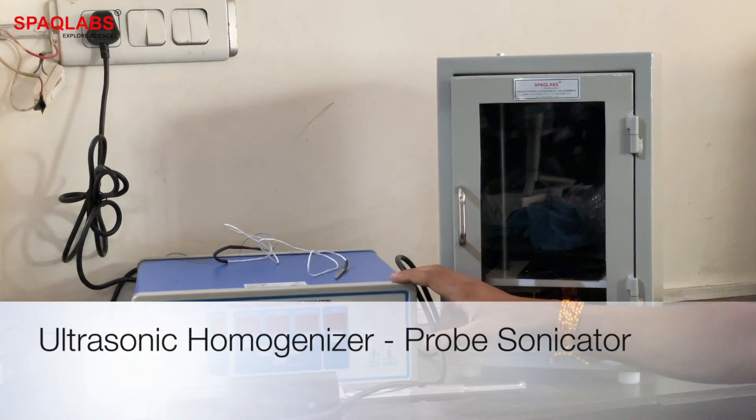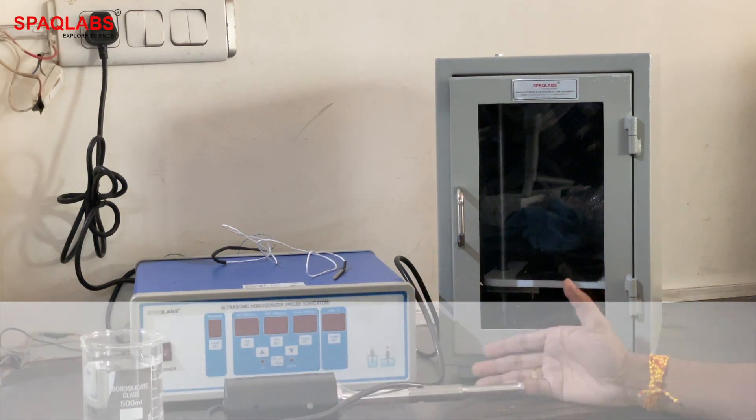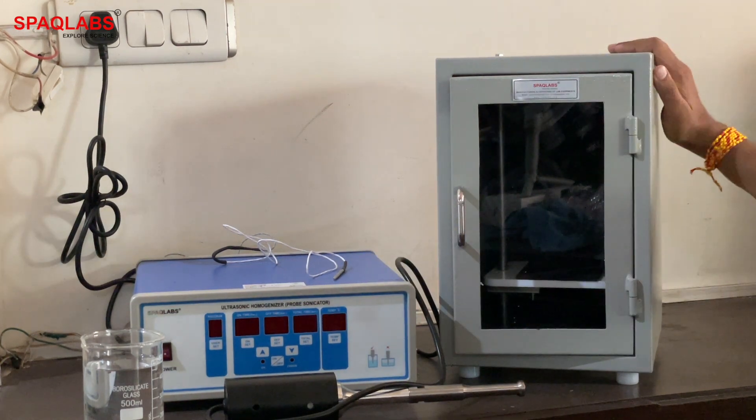This is an ultrasonic homogenizer, also called a probe sonicator. We will now see how to use it. This is the probe sonicator and this is its soundproof box.